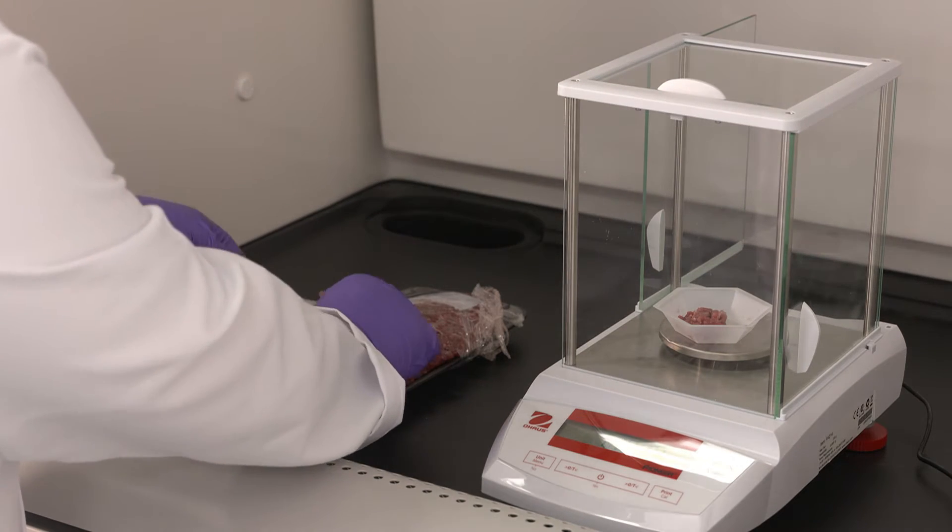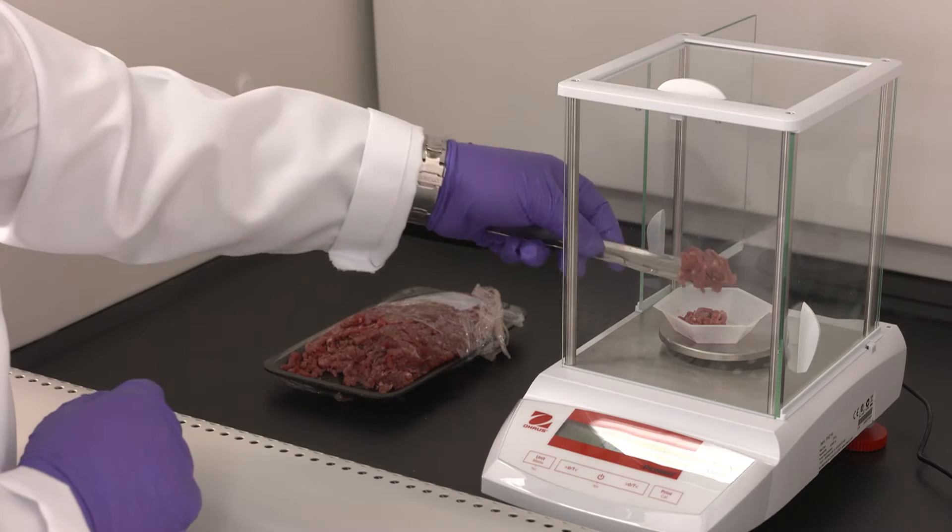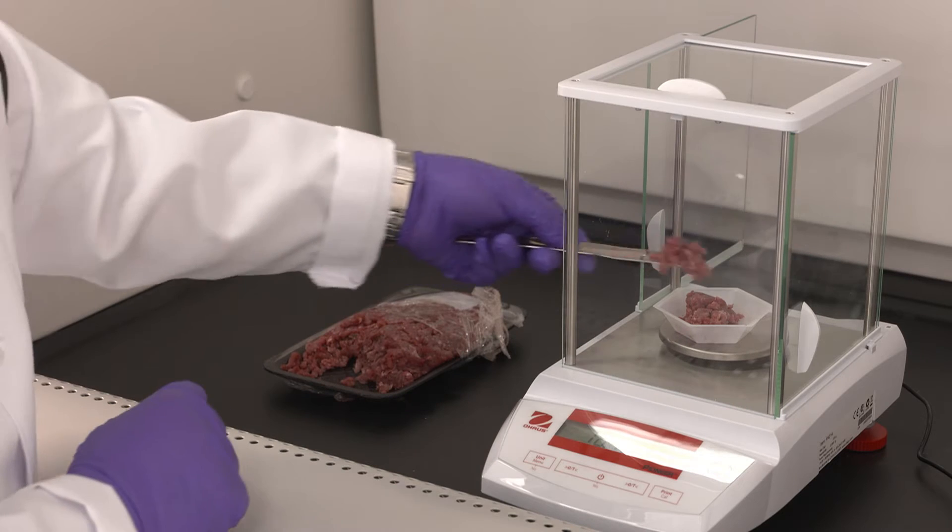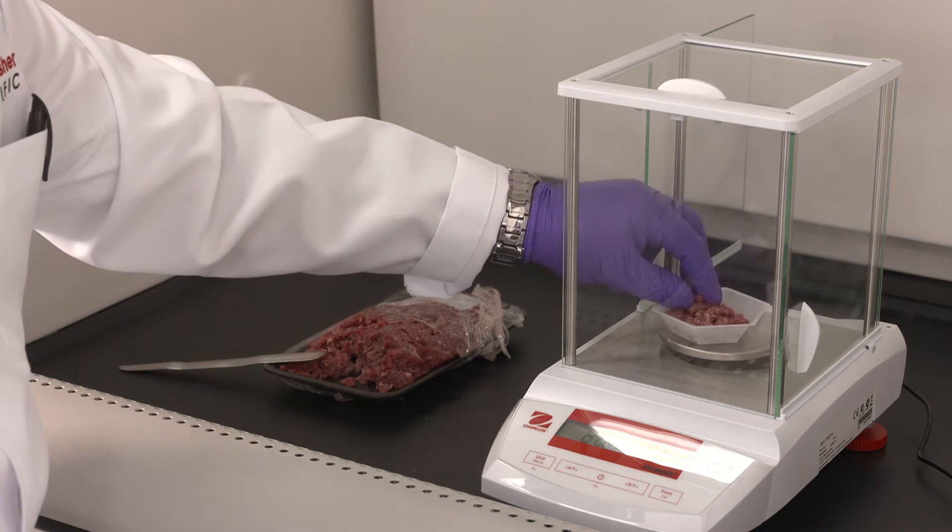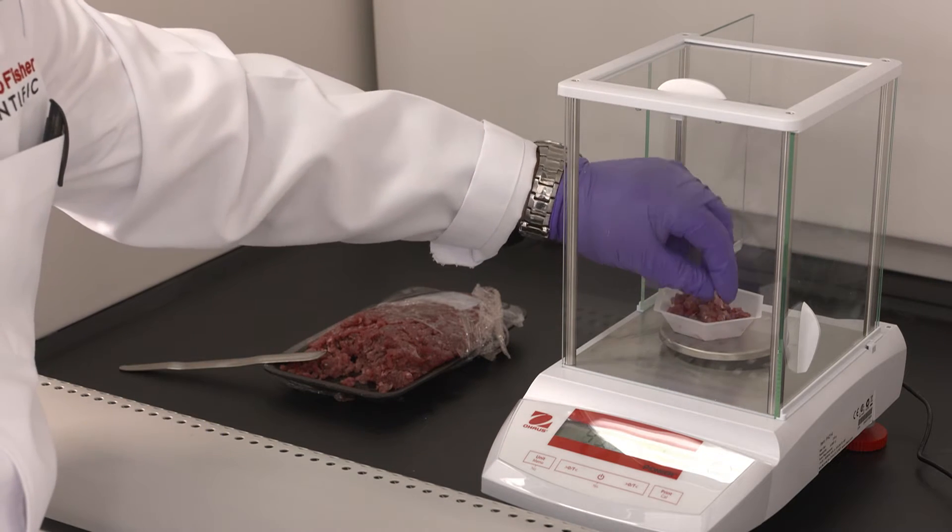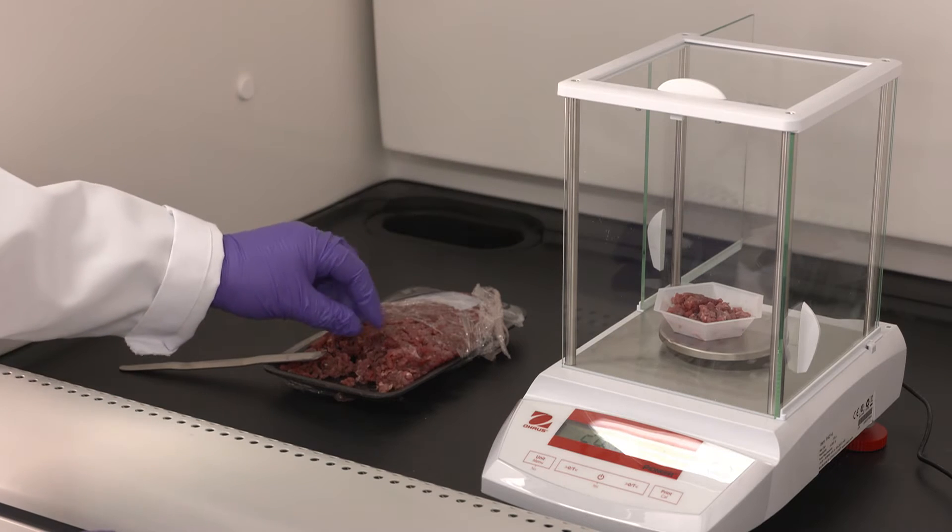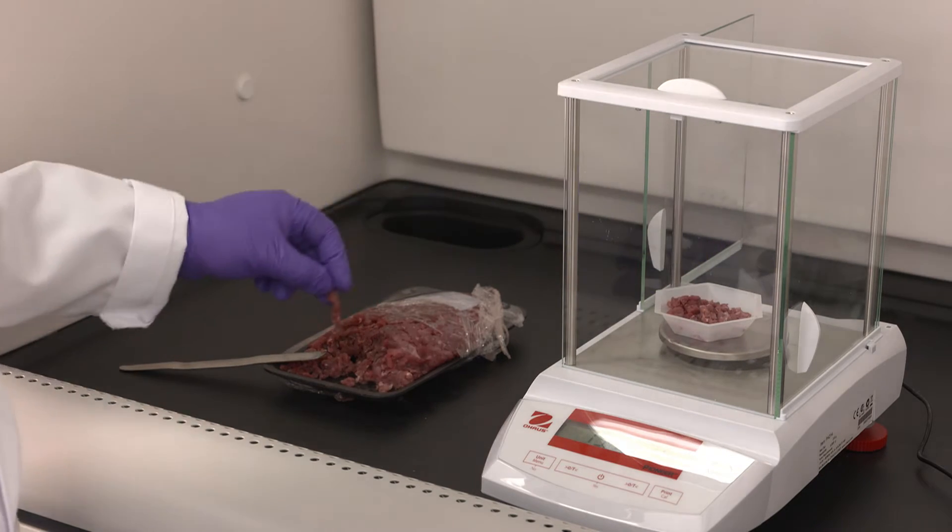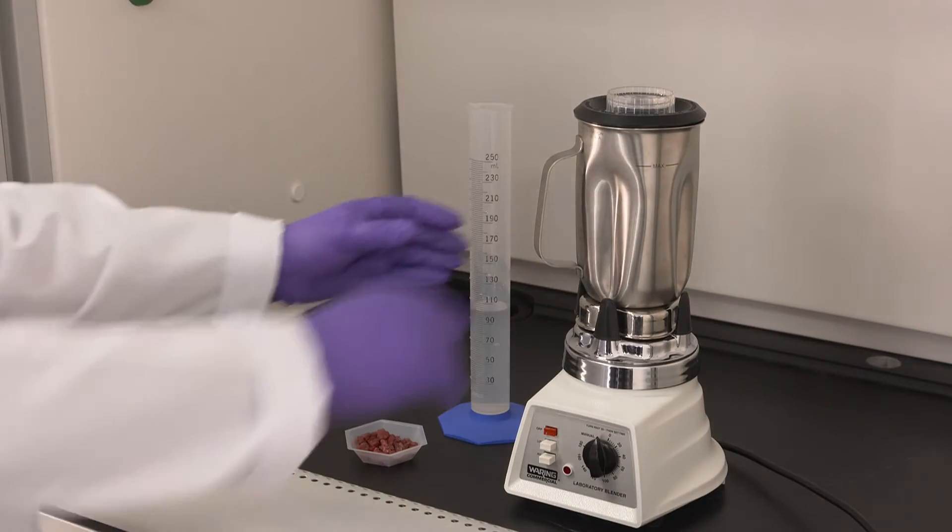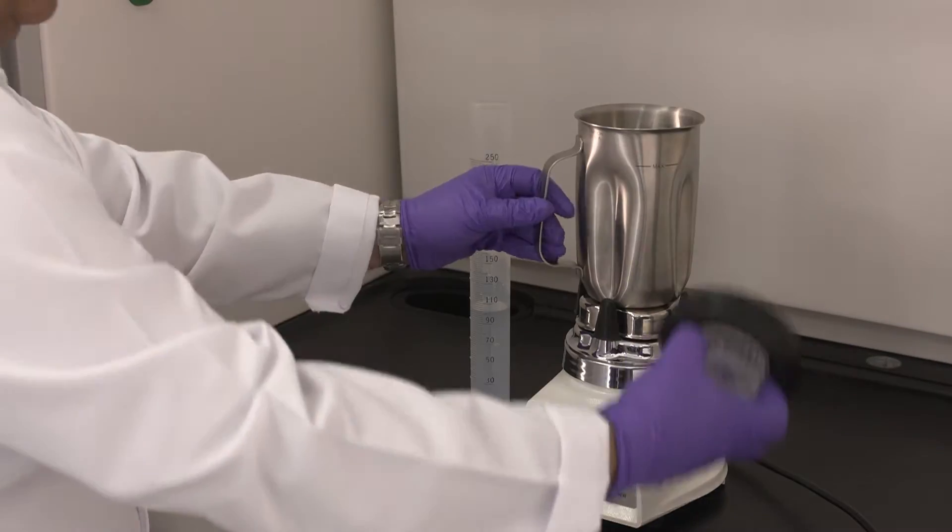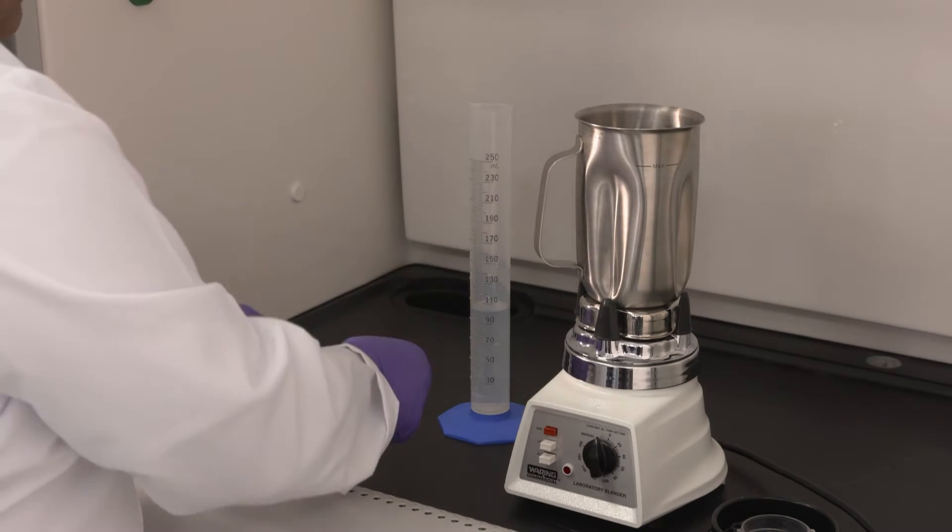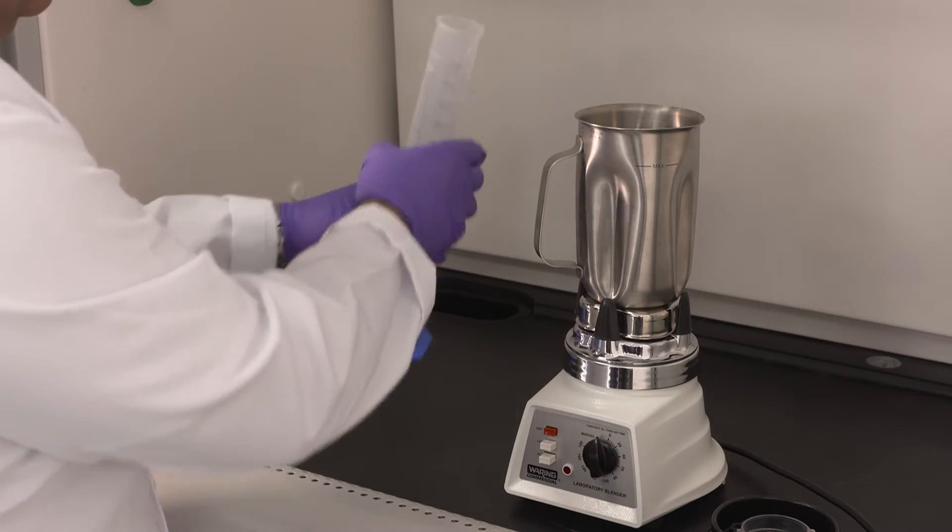That will be the following step where we will homogenize the meat in water at a ratio of 1 to 5. When it's weighed precisely, we can add the precise amount of water and adjust the volume according to the weight. We will put the meat in the blender, add 100 ml of water, and turn on the mixer for 2 minutes.